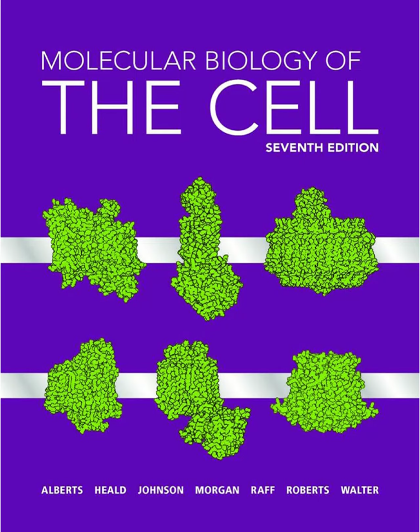Exactly. It causes a subtle shift in the phase of the light waves. Our eyes can't see phase shifts, but these microscopes convert those invisible phase differences into visible differences in amplitude or brightness. So suddenly, transparent things become visible. You see edges, organelles. Precisely. You get contrast in living, unstained cells, allowing you to see their structure and, importantly, watch them move and change. Which is perfect for things like watching cell division, mitosis, or cells migrating.